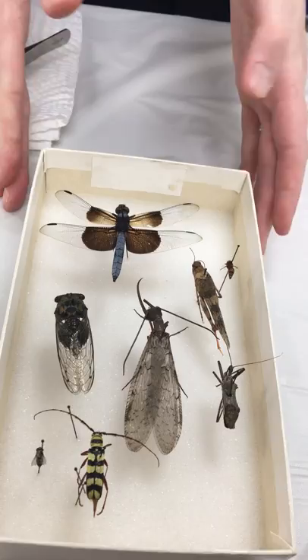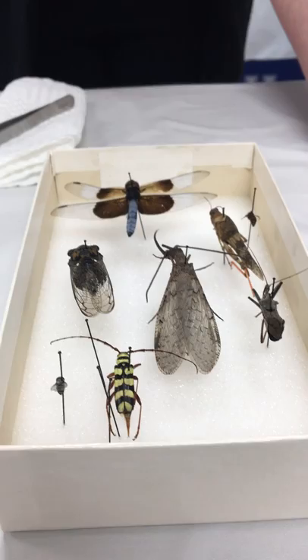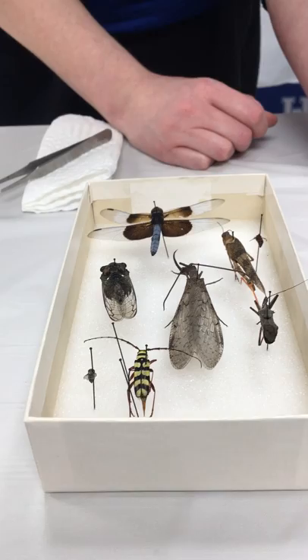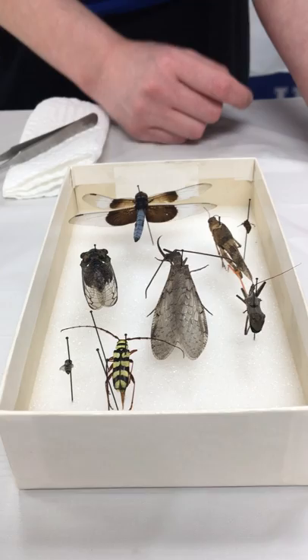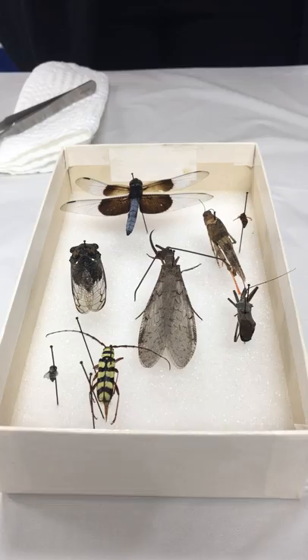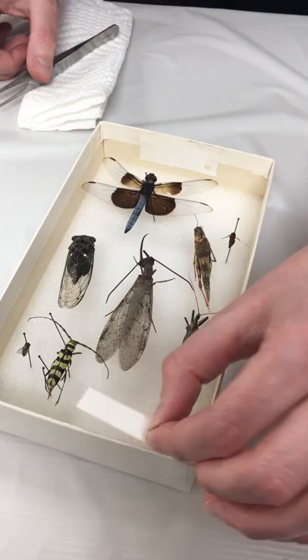If you have an insect like this longhorn beetle with a large abdomen, you might have to split it open, pull out the organs, clean it out, and stuff it with a little dry clean cotton so it retains its shape without rotting. For a specimen this size you're probably okay, but for large insects like Madagascar hissing cockroaches you'll definitely want to remove as much moisture from the abdomen as you can. If the abdomen looks like it's falling back, you can even use pieces of card stock to hold it up and let it dry in position.